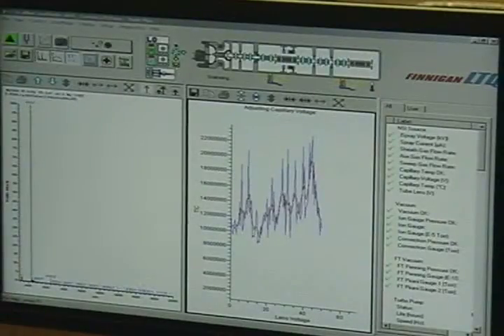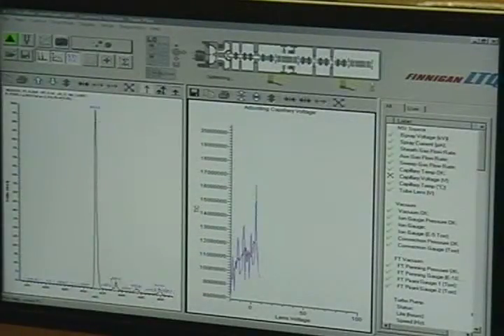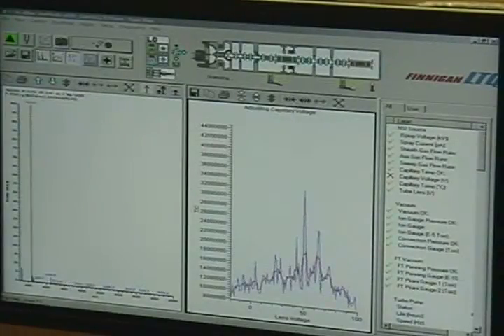Then you can take a step size to like a volt or 2 step size. That way the plot goes fast. Now he's going to extend it further. He's going to try to see the maximum. Yeah, so here's the rise. Yeah, this is designed for reserpine. Okay. And peptides don't tune anything like reserpine. There we go. Okay, so that one's accept.